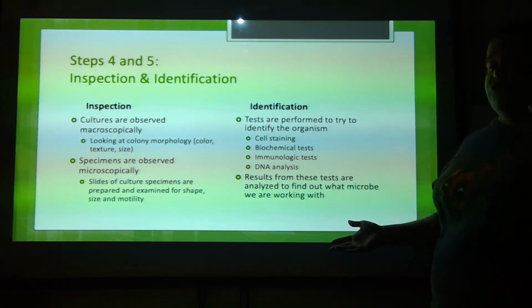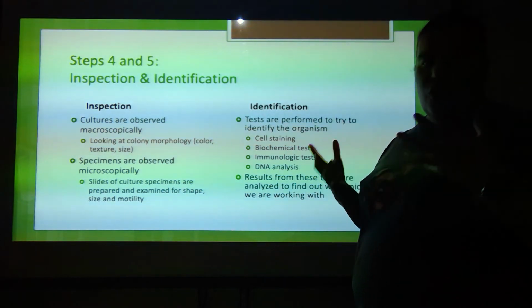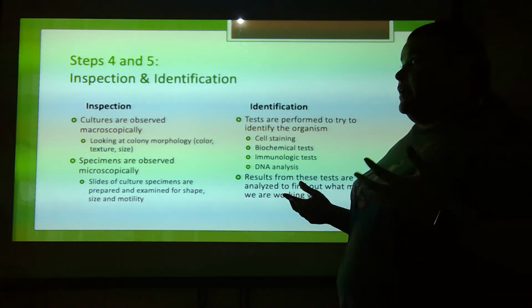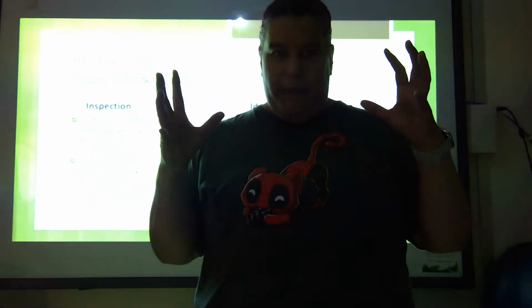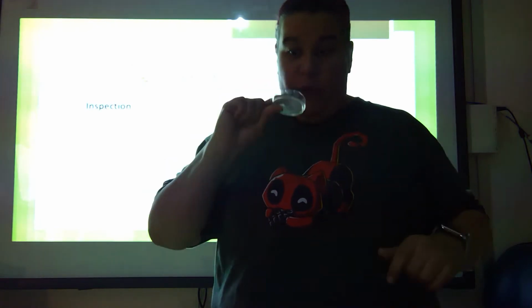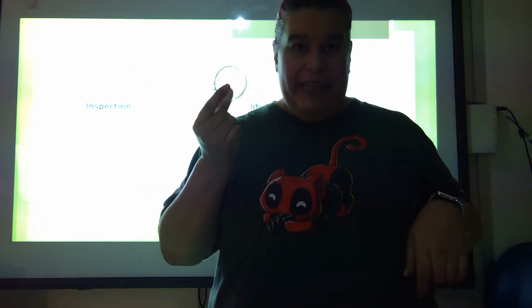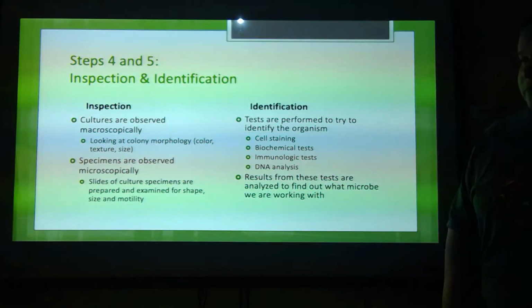Okay, so inspection. You've got cultures that you are observing macroscopically. So micro meant small, macro means big. In other words, I'm going to look at the plate and with my eyes get a description of what I'm seeing.